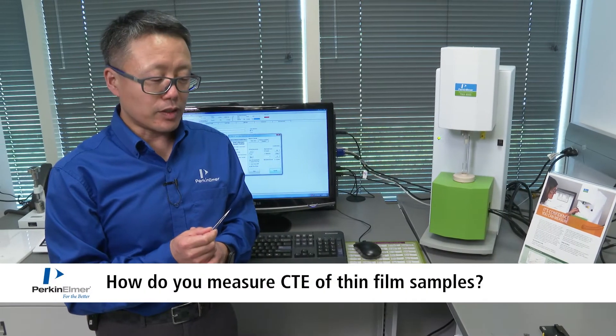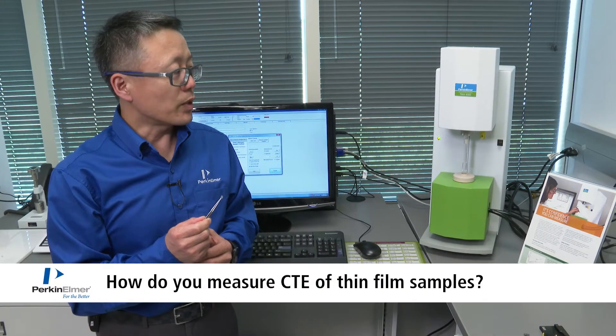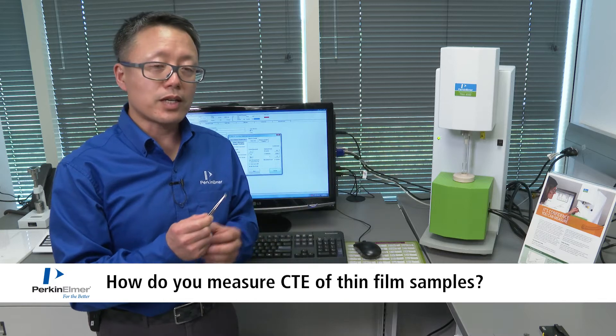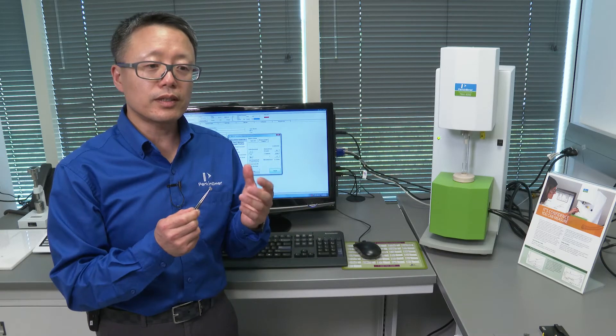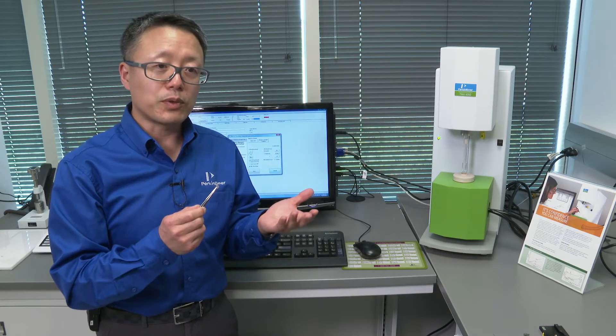The third kind of sample is film samples. We can also use a TMA to measure the thermal expansion for film samples or fiber samples.